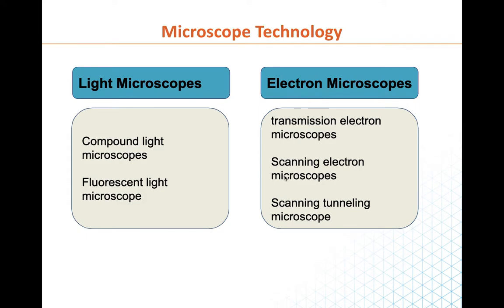And we have three different types of these. Just so you know, the electron microscopes are way more powerful than the light ones. The light microscopes are the ones that you've seen in the labs at school. They are very, very useful when it comes to looking at cells. But if you want to get detail into the cell or to look inside the cell and see what could possibly be happening in there at such a tiny scale, you have to switch to an electron microscope.